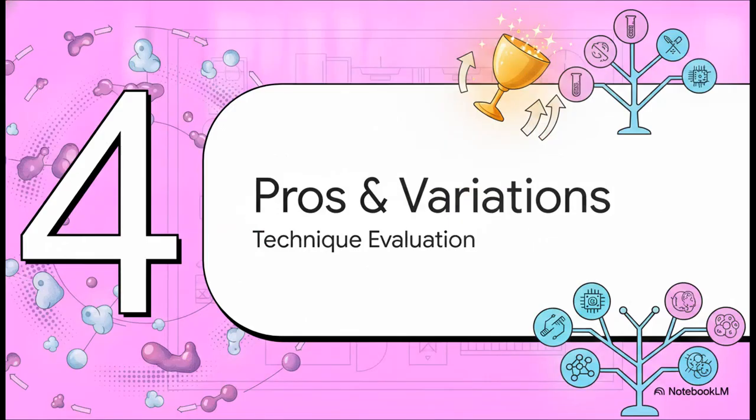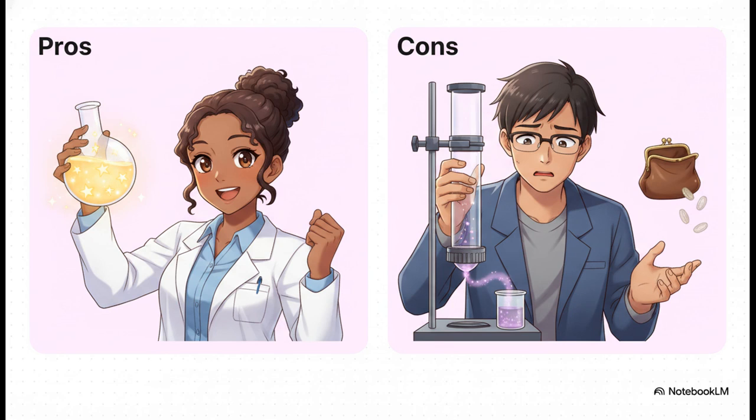But let's do a quick reality check. Section 4, pros, cons, and variations. The advantages here are honestly staggering. You're getting exceptional selectivity, sometimes hitting a several thousand-fold purification in literally one single rapid step. It gives you incredible recovery rates while preserving the delicate biological activity of your molecule.